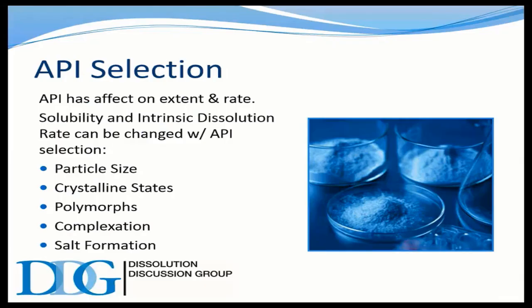We have to be careful with polymorphs. This really comes up during an intrinsic study where you're using a pretty significant amount of pressure to make a compact or a pellet to determine the rate that this drug's going into solution, but we don't see it exist that much in terms of solubility testing. And then, of course, there's complexation and salt formation as well.